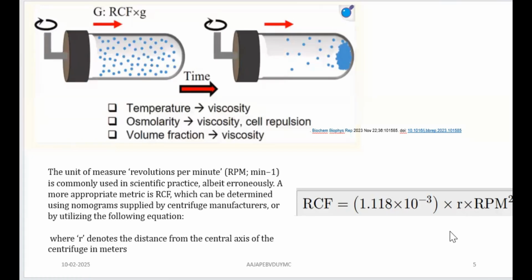So just imagine a centrifuge and you have kept the tubes. Now, is the tube going to move if your centrifuge is of the fixed angle type? No, they are fixed at a particular angle, right? So what is going to happen is that the R experienced by the tube at a particular position in a fixed angle is going to remain constant. So ultimately, RCF is going to be largely dependent on variations in the RPM value alone, right? So in true terms, R is the distance between the particle in the sample holder and the rotor axis.